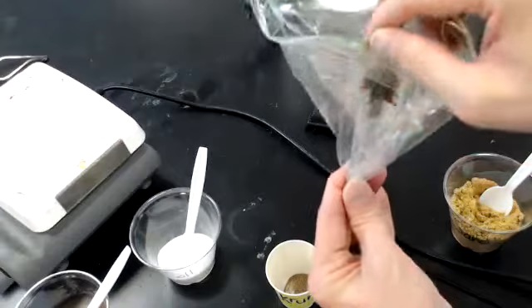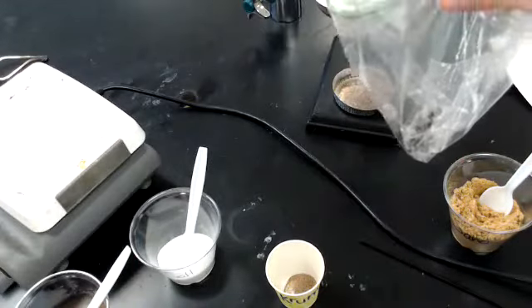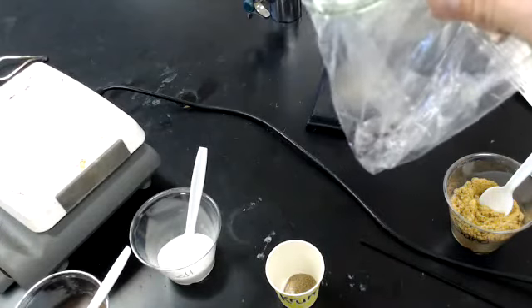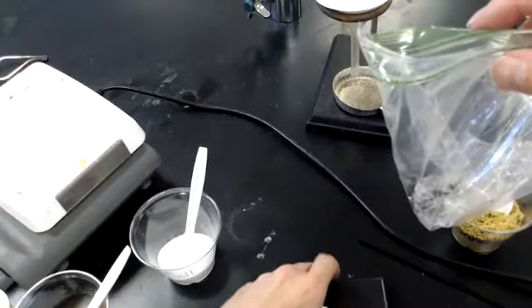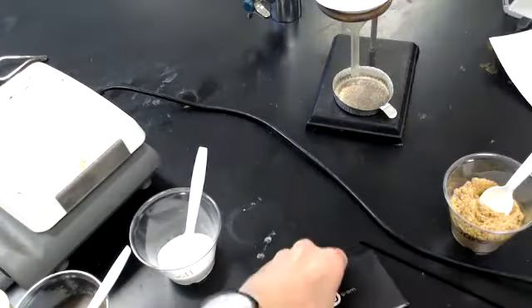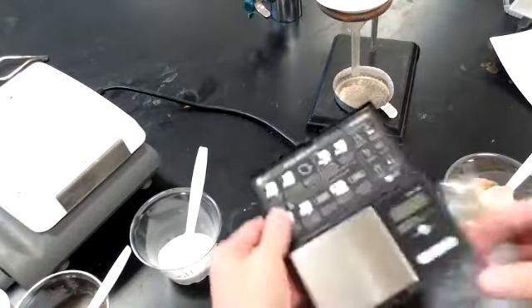All right, here goes the magic. Now, when I pull away, the magnet is clean and all the iron's in the baggie. Okay. And like I said, I now want the mass of the iron in this baggie. So I'm going to get, apparently I can't open it one-handed. I'm being beat by a lid. There we go.